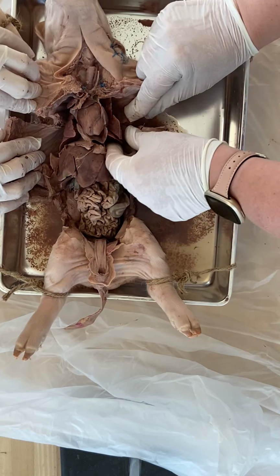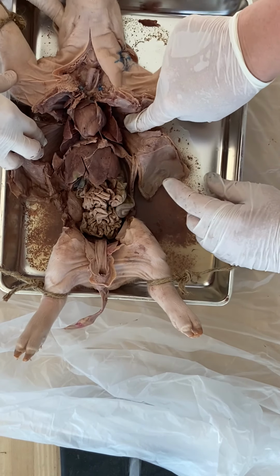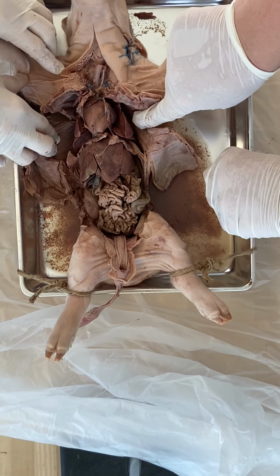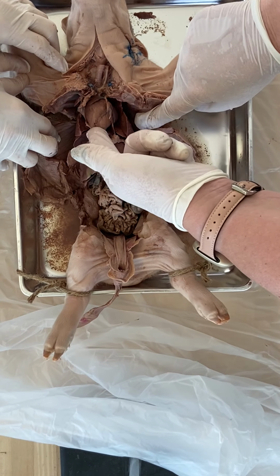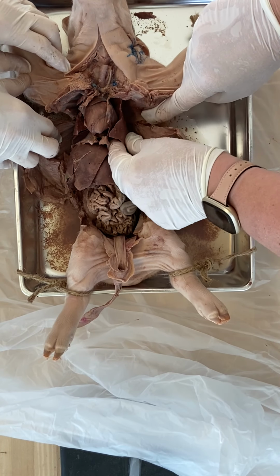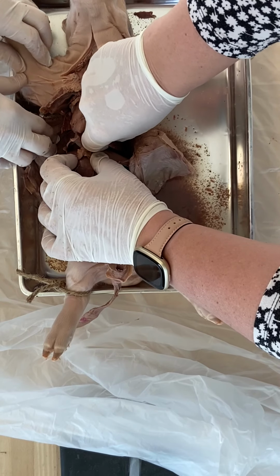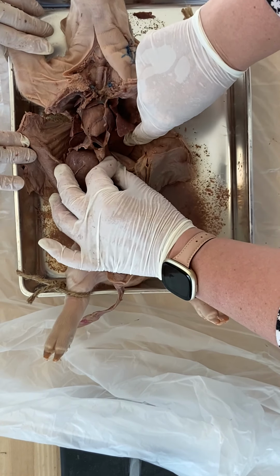So, pig's lungs: the heart more dangles down, obviously, because it walks on four legs, of course, not two. So its heart is sort of dangling down in front of the lungs. Our lungs, of course, are more to the side. But you can see them. I'm trying to get right down to the bottom of this lung. There we go, all the way.